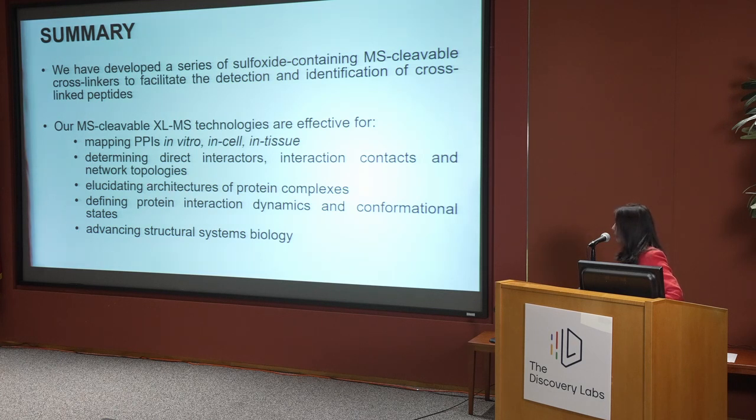In addition, and related to this specific symposium, I believe that our strategy can be coupled with different affinity purification approaches, especially proximity labeling, to capture the E3 ligases for the target substrates, and then work with molecular glue to identify the interactors.